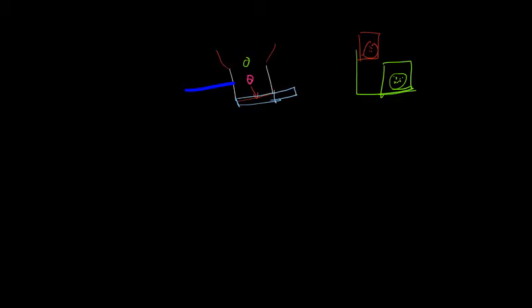A nozzle is a device which has an orifice, and the cells exit through the nozzle. Why do we put the nozzle here? If we don't have anything, it would be a thick stream of sample coming out, and we wouldn't have control over the stream.